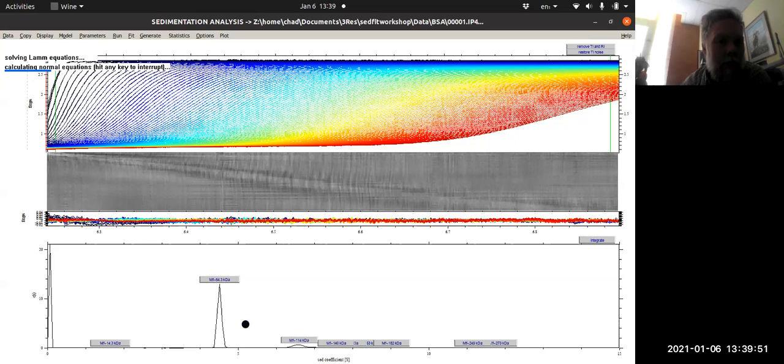And if it works, what you'll see is that the model in the lower panel looks like it's got just a line plotting the fitting the data. So your C of S distribution doesn't have any width to the peaks. The peaks are just a line. If it doesn't work, then the C of S distribution has to sort of backfill in these little bumps near the line. And we'll see how that looks because I suspect it won't work perfectly with this one.